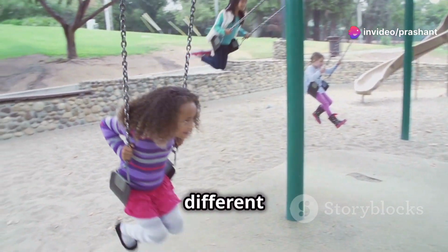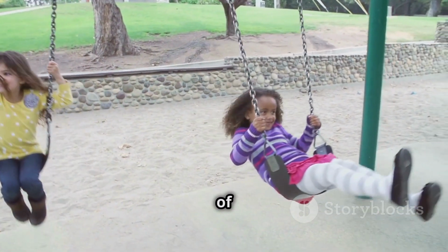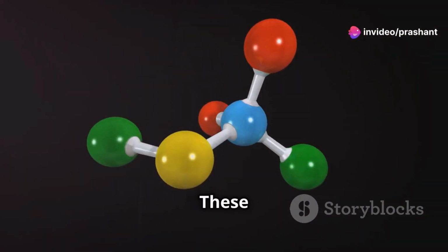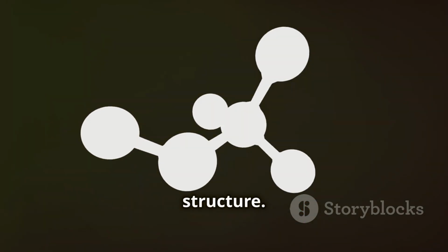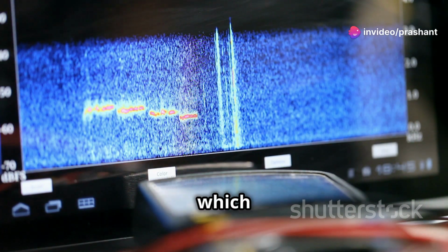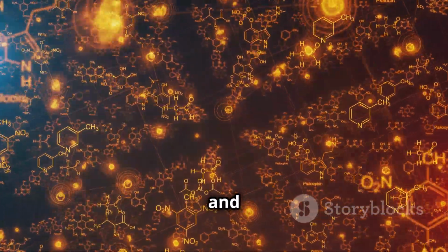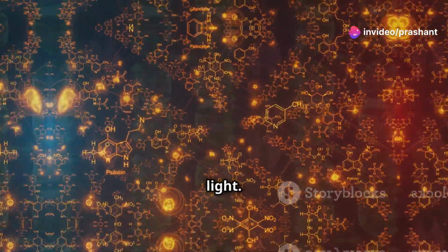Think of it like this: different types of swings at a playground swing at different speeds. Just as each swing has its own rhythm, each part of a molecule vibrates at its own frequency. Similarly, different parts of a molecule vibrate at different frequencies when excited by infrared light. These vibrations are like the molecule's dance moves, each one unique and telling a story about the molecule's structure. This absorption of specific wavelengths creates a unique pattern called an infrared spectrum, which acts as the molecule's identifying fingerprint. Pretty cool, right? By analyzing this spectrum, scientists can determine the molecular structure and identify unknown substances. It's like solving a molecular mystery with the help of infrared light.